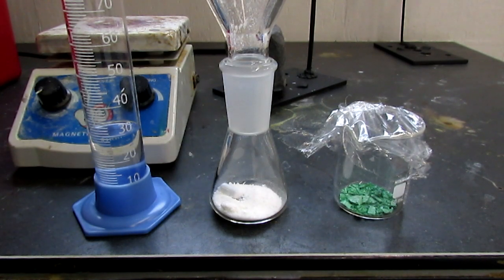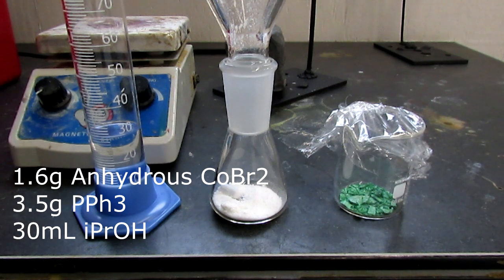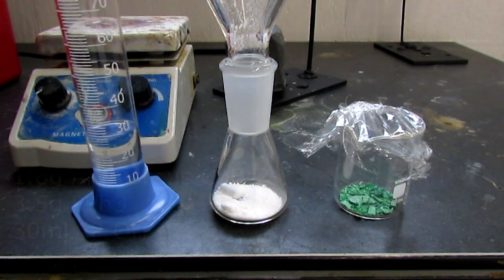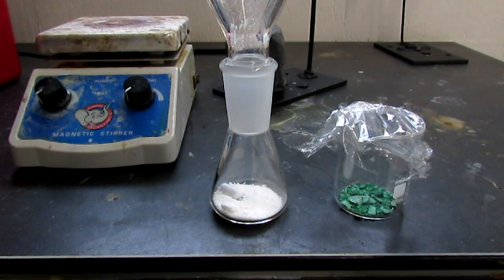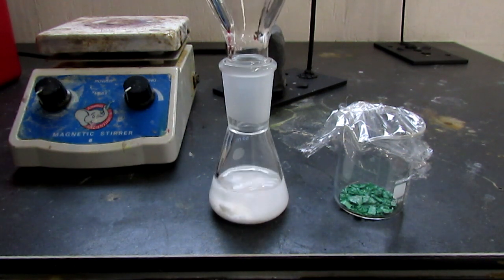Now we're going to make the bis(triphenylphosphine) cobalt bromide complex. Like before, we have 30 mL of isopropanol. This time we have 3.5 grams of triphenylphosphine and 1.6 grams of cobalt bromide. So let's get this dissolving and refluxing, and then we'll add the cobalt bromide to it.